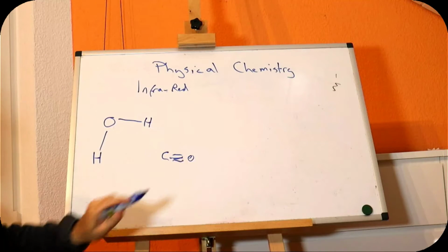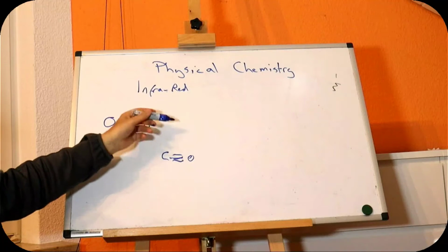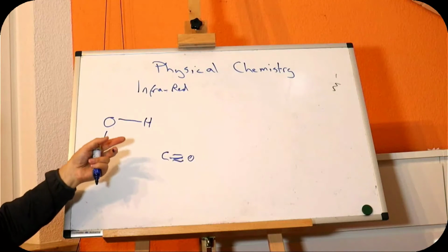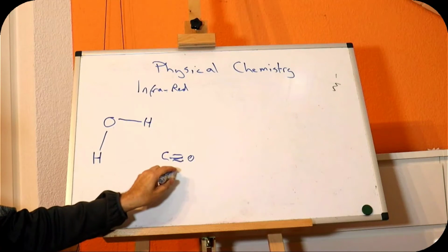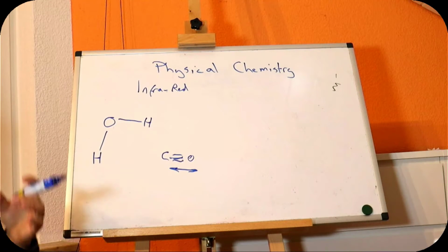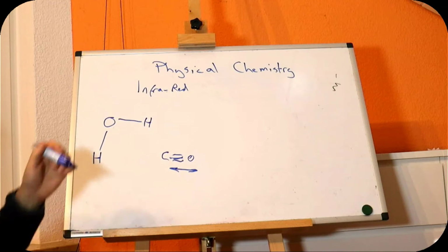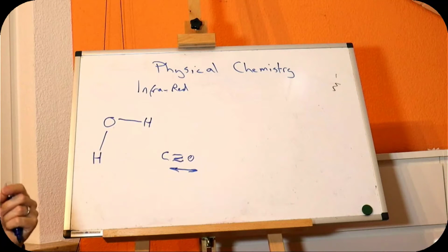If we take a carbon monoxide molecule, it can't do very much. It can't bend because that would just be the same as rotating. It can't do anything apart from stretch effectively. So it's just stretching in this direction and compressing in this direction, or it's rotating. Oscillation of this bond can be excited by infrared, and that we can see if we measure it.